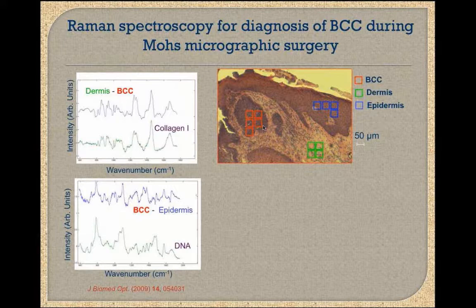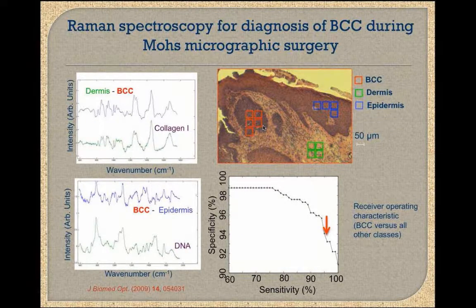So now that this confidence is built, let's see, so this is the classification model. This is the receiver operating characteristic for our diagnosis model. So you can see you can achieve very high sensitivity, even 100% sensitivity for a specificity of about 91%. The point on this curve where we like to work is at around 95% sensitivity, which means 95% specificity as well. So all of this is based on independent, of course, validation of the classifiers.